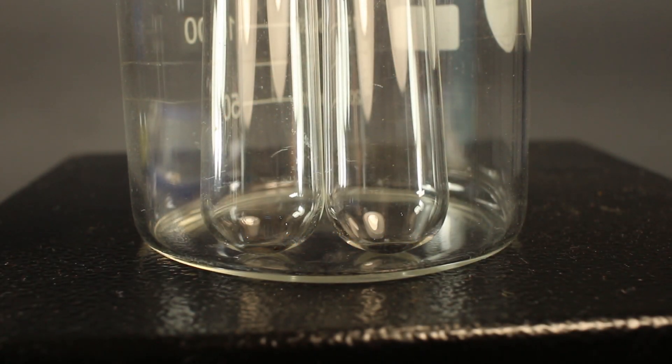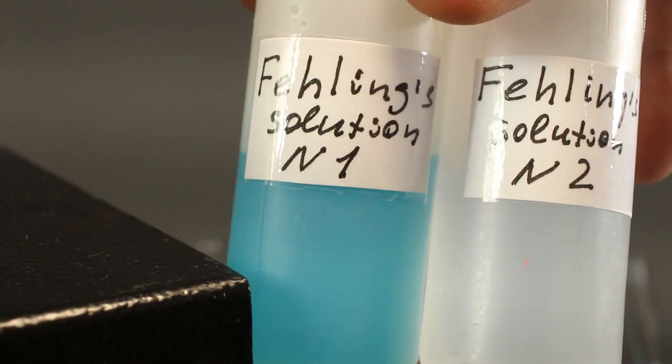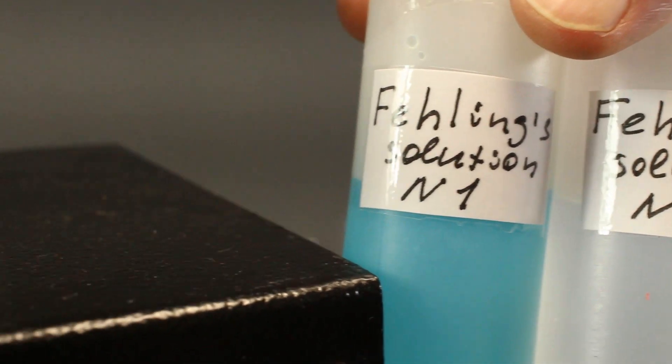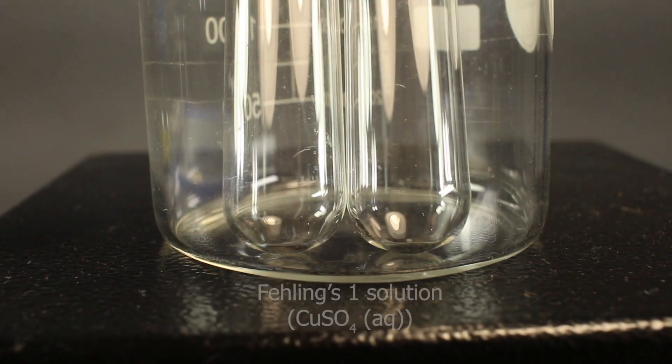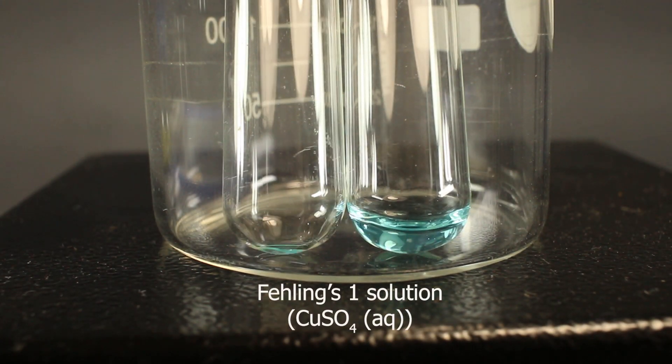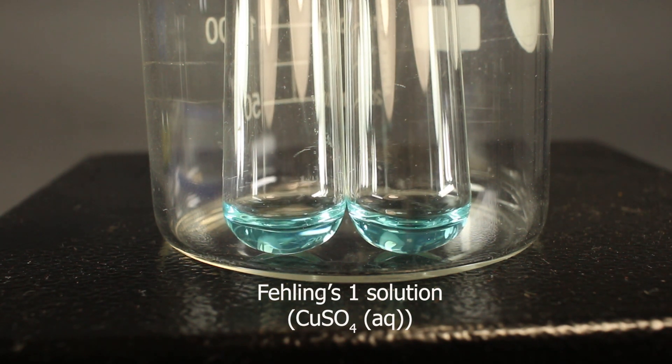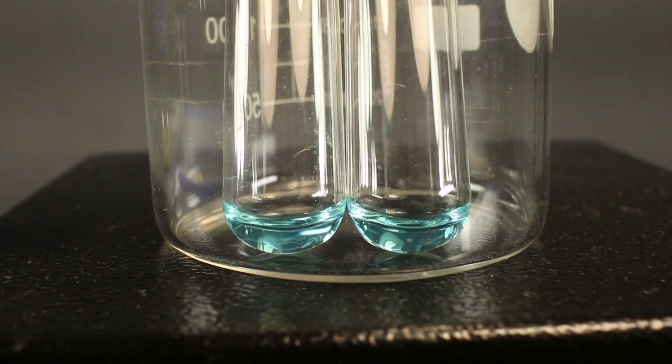What is it actually? It's a mixture of two solutions, Fehling 1 and Fehling 2, which have to be mixed just before making the test. Fehling 1 is just solution of copper 2 sulfate in water, light blue liquid. And Fehling 2 is solution of sodium hydroxide and potassium sodium tartrate.